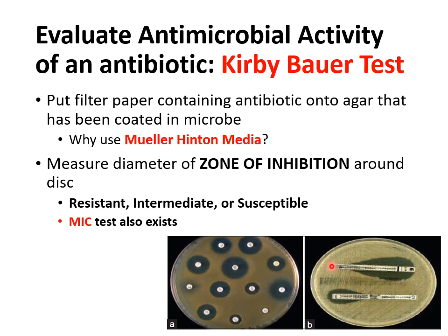Because this is a very low concentration of that antibiotic, and it increases until this is the highest possible concentration of that antibiotic. So this is a very valuable technique because not only does it let you know if that bacterium is resistant or susceptible to that antibiotic, but it lets you know the exact range of concentration that will kill that bacterium. So for instance, right over here would be the minimum concentration that you would be able to use to kill that bacterium, because you notice below that you don't see any death occurring.